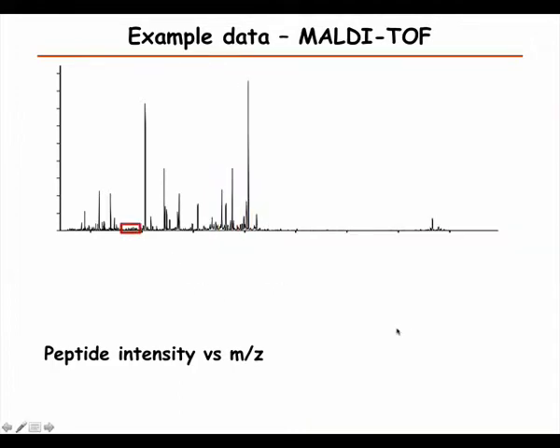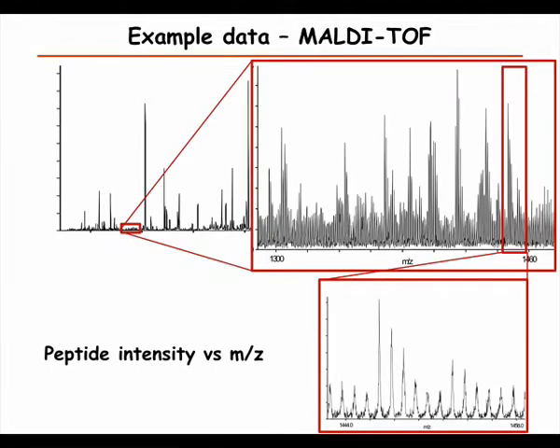In this case, we can also zoom into an area that has seemingly very little, but it actually turns out that even here there are peaks that correspond to peptides. But here we see another phenomenon: in these spectra we get a peak at pretty much every mass, because we have such a complex mixture of low abundant peptides that we need to decide what's a real peptide and what's just a mixture of other peaks.